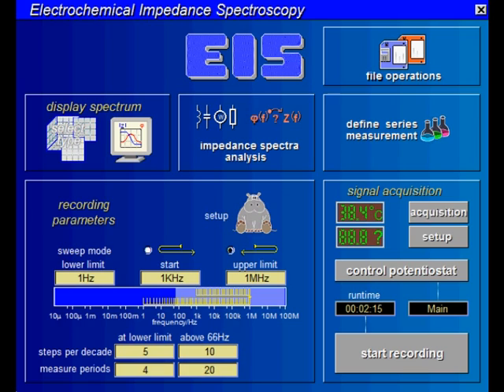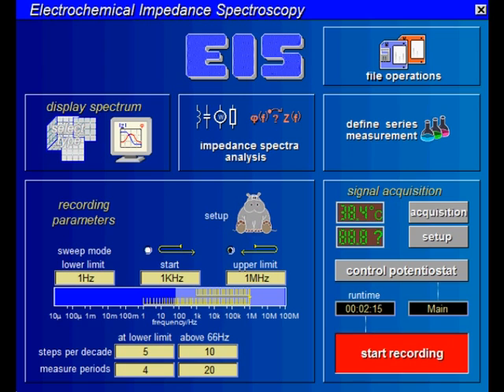Please remember that measurement time increases with decreasing frequency. A high number of averaging counts in the low frequency range can prolong your measurement time drastically. Here the estimated duration of your measurement is shown. If all the settings are done, you can start the EIS measurement here.